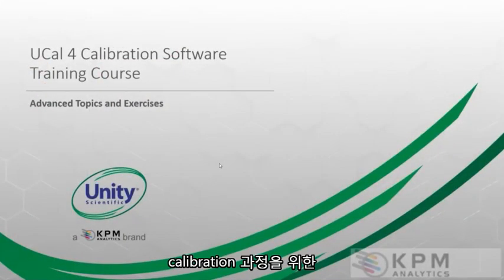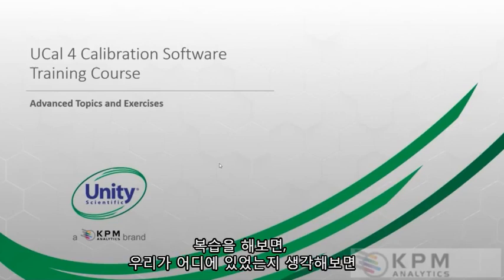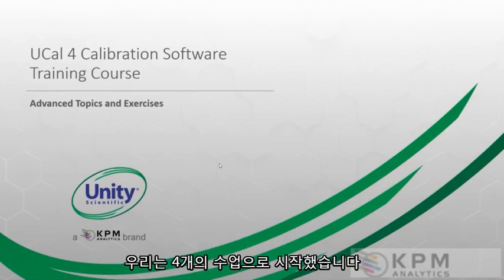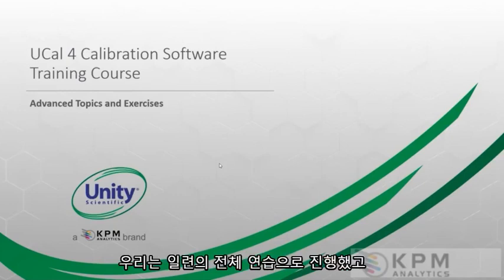Okay, we're getting to the point that we're wrapping up our UCal 4 calibration course. If we think about where we've been, we started out with 4 lessons. We talked about some of the theory and principles that are involved with near-infrared spectroscopy. We then moved down to a whole series of exercises.